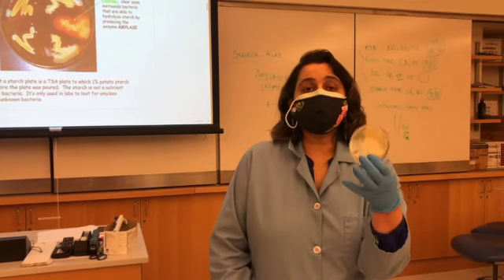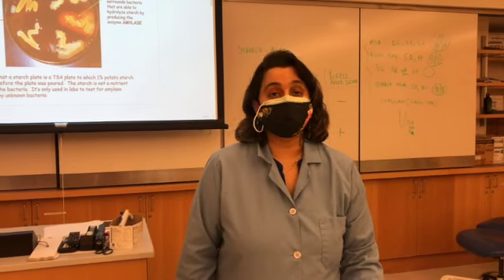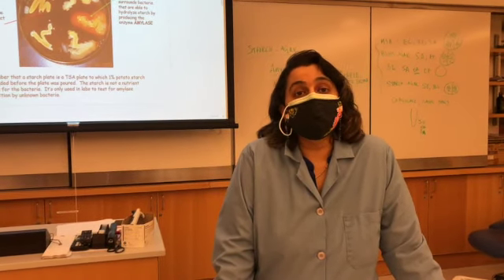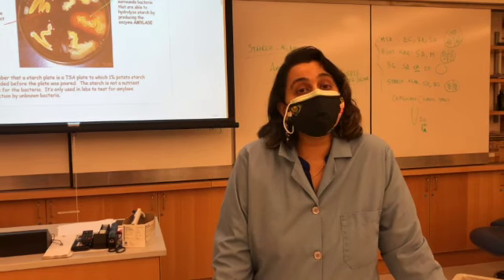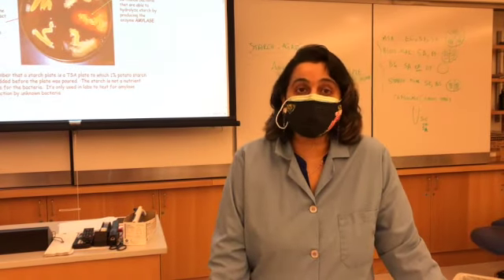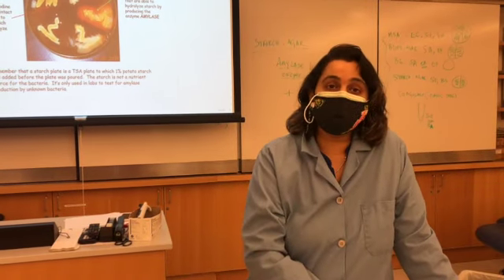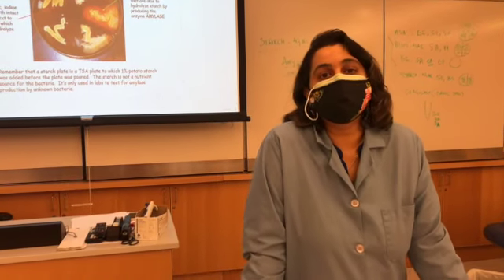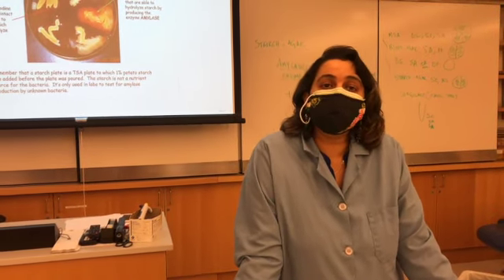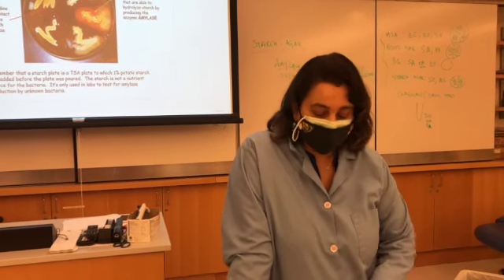And how can you identify the presence of starch? So bacteria, if they have the enzyme amylase, they can break down the starch. So here, by adding starch, you are identifying the bacteria that has amylase enzyme. Okay? So if the bacteria has amylase, the starch that is present in the media would be all broken down. And how will you identify whether the starch is intact or is it degraded? Go back to your chemistry basics. What will happen if you add iodine to starch? You will get a dark purple color.